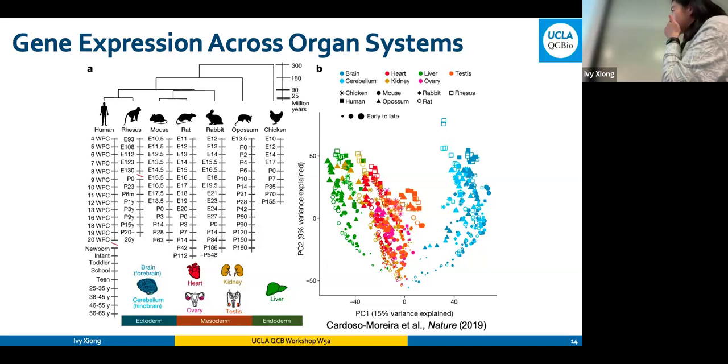What they have done here is a PCA, a principal component plot looking at the first and the second principal component. So this kind of decomposition, I guess you start to appreciate already. So we see this time trajectory coming down from the center bottom here, spanning out upwards.